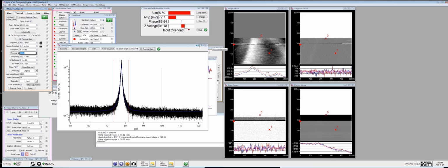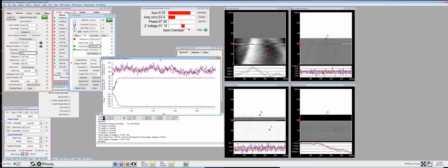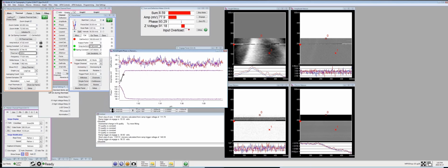So this takes us to the last step for data acquisition for force reconstruction. First thing I want to clarify is it's very important to get all the points, force versus distance points. To do that, we will employ a method called the smooth transition method. What that does is the free amplitude will be very large, large enough that the tip will never be trapped onto the surface. So we make sure that we can access all the distances on the surface.